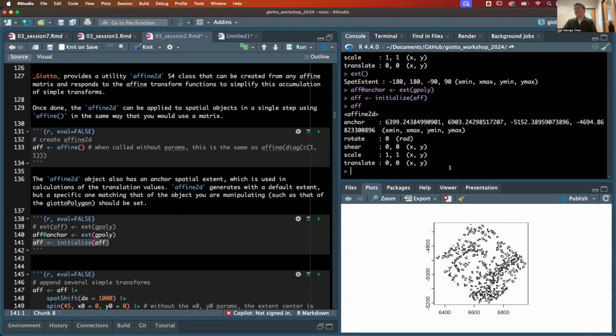as your affine. The exact way that those are calculated is, I guess, not very relevant. It's really just matrix decomposition. It's not going to be exactly the same things you fed in order to make that affine. It's just a decomposition of the matrix itself. So there are a lot of possible ways to get to your endpoint, is basically what I'm trying to say. And this is just one of them. Probably the most simple one.